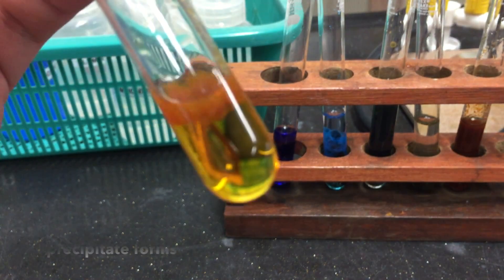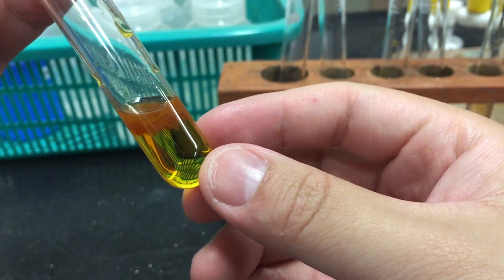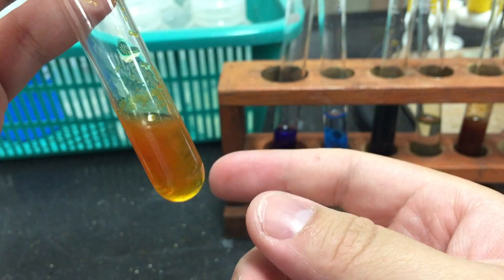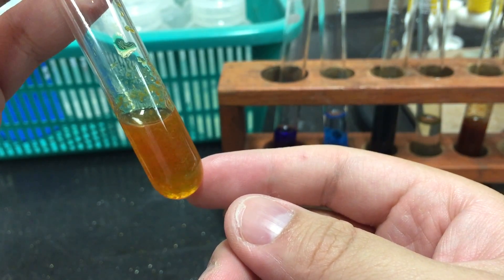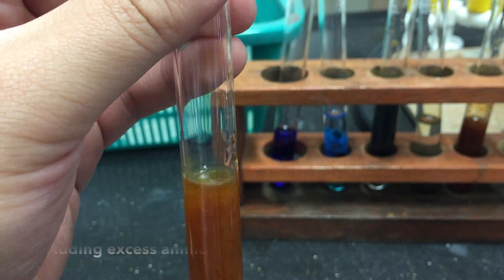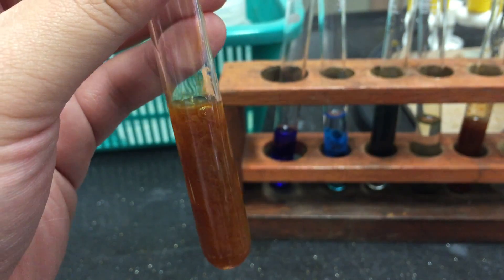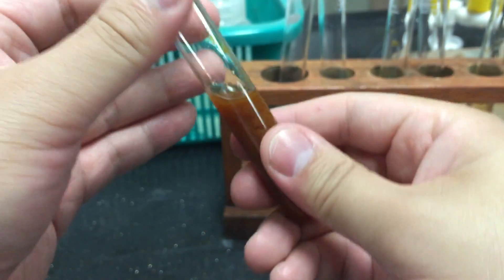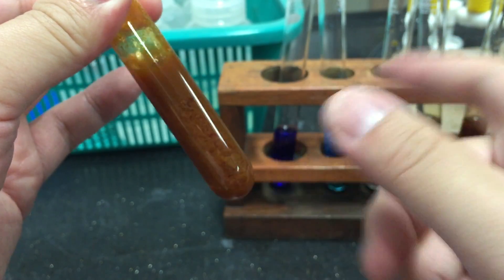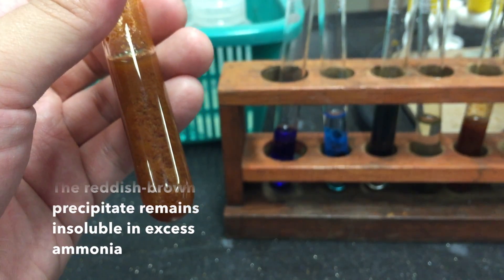Notice that the red-brown precipitate forms immediately. Proceed to add an excess of ammonia solution into your test tube. Shake your test tube to ensure thorough mixing. Notice that the red-brown precipitate remains insoluble in excess ammonia.